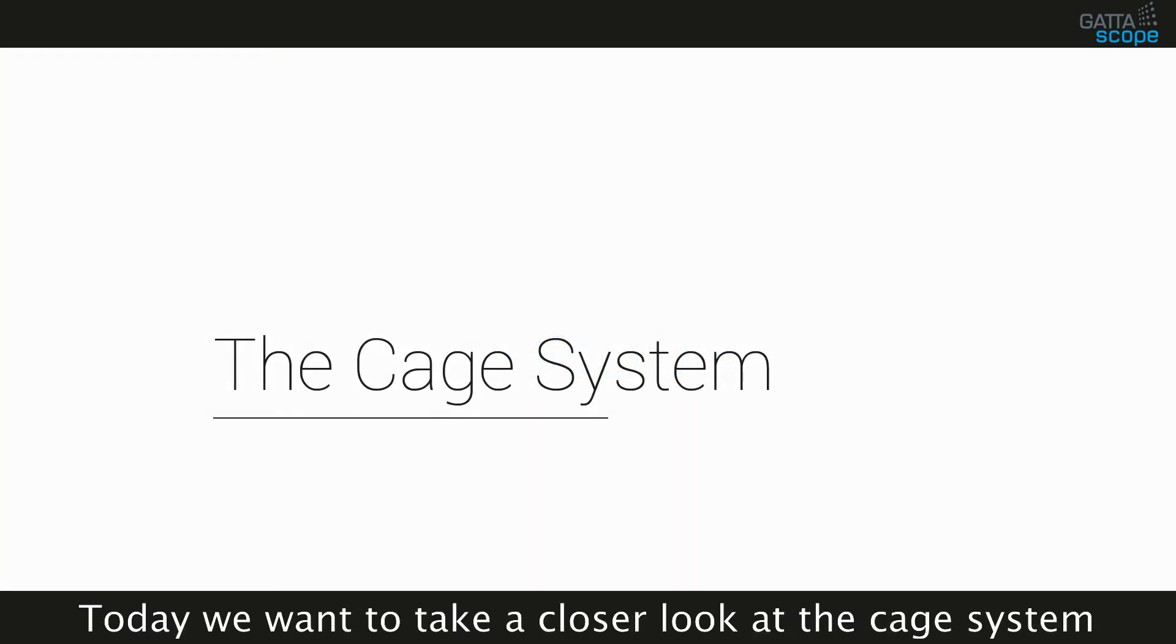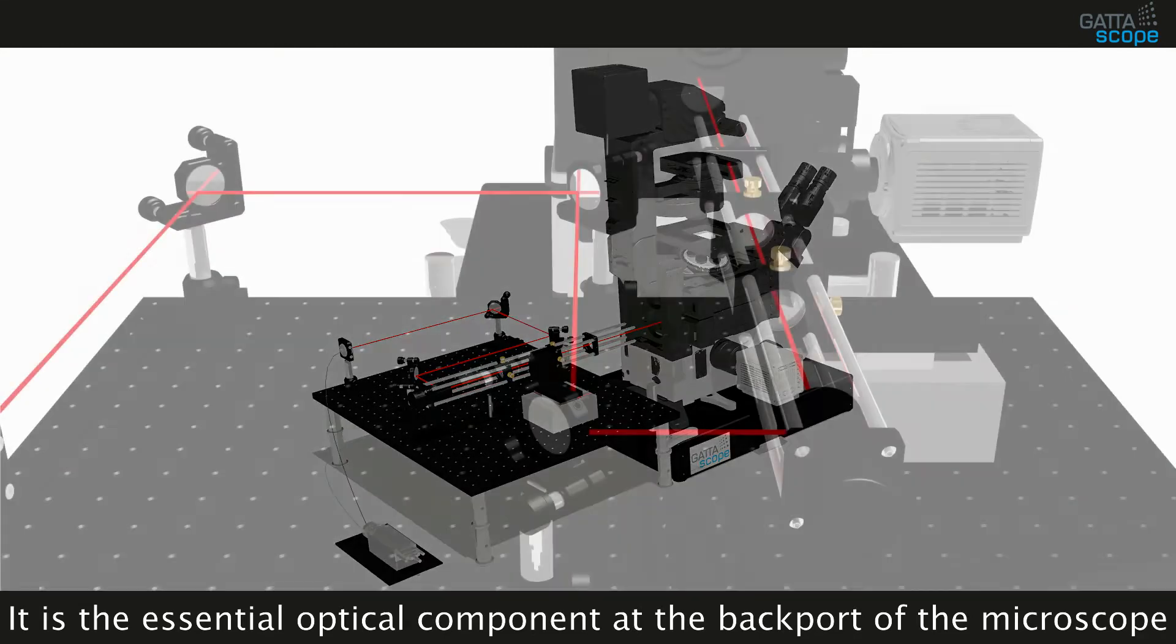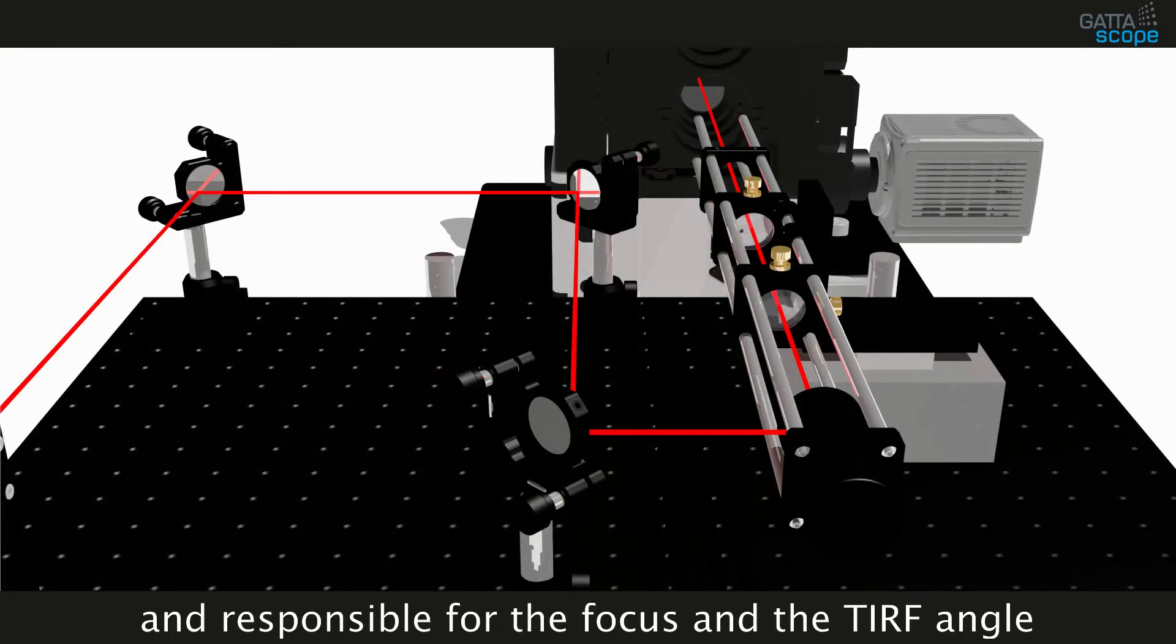Today we want to take a closer look at the CAGE system. It is the essential optical component at the backport of the microscope and responsible for the focus and the TIRF angle.